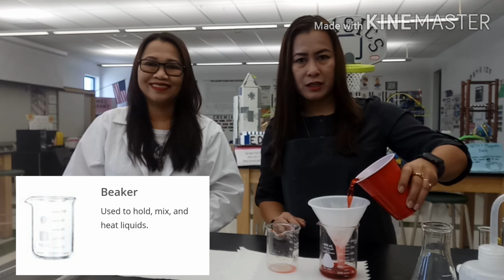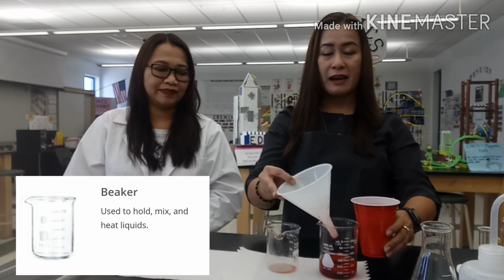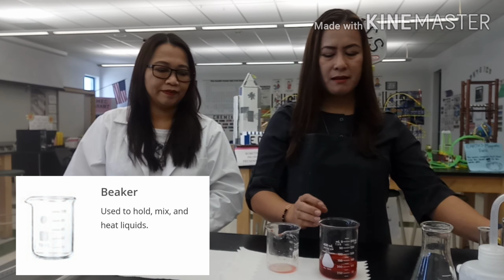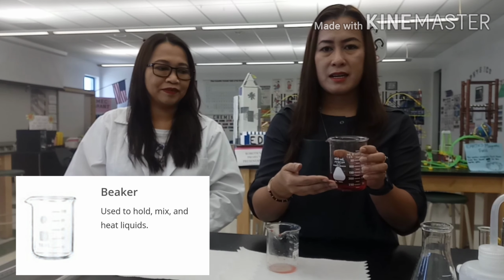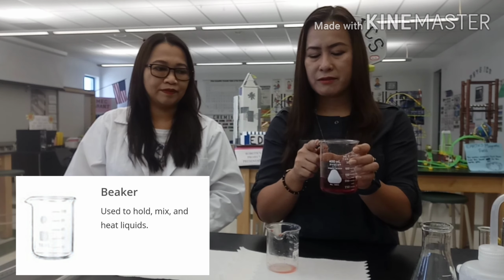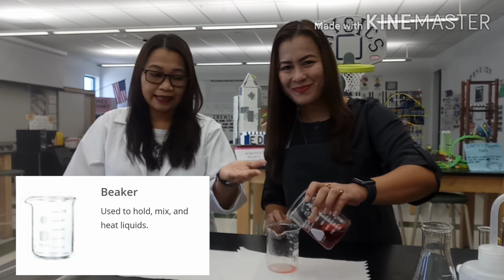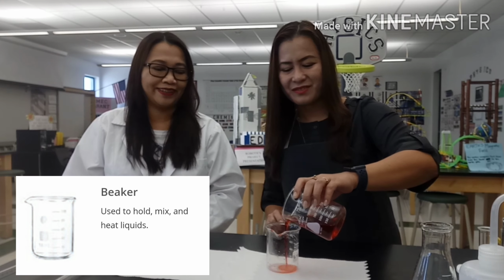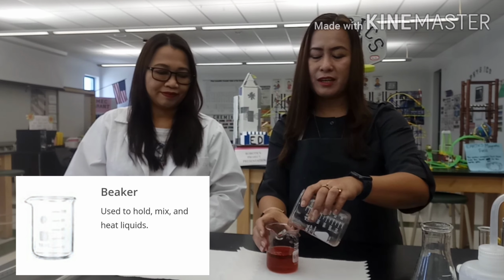So here is your liquid. Say for example, we have that amount of liquid over there. Here, you see your beaker has a calibration and has a pointed mouth on the side, which is used for pouring. That helps you to pour that amount of liquid into this container. So this is how you're going to use the beaker whenever you perform an experiment. Is it easy? Very easy.